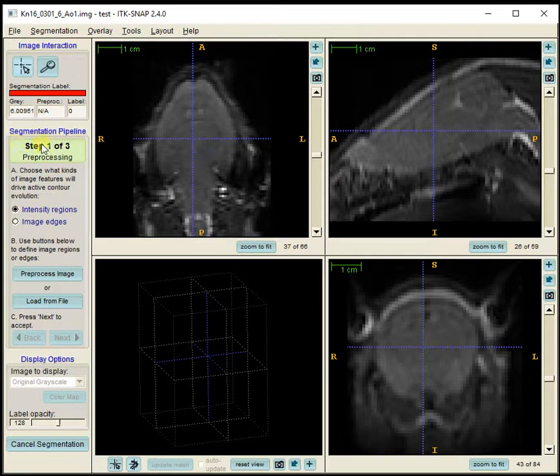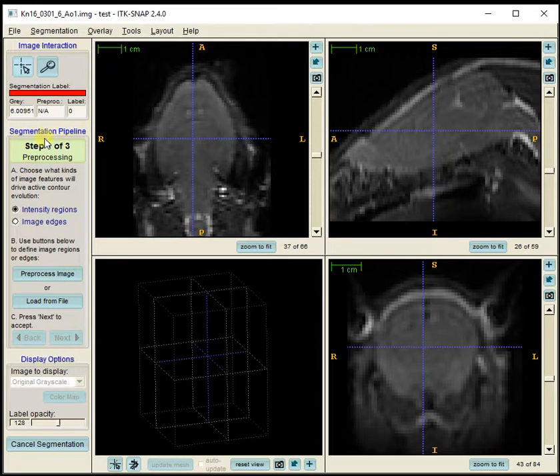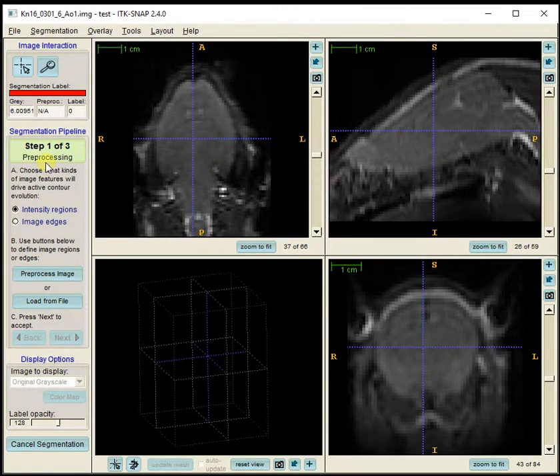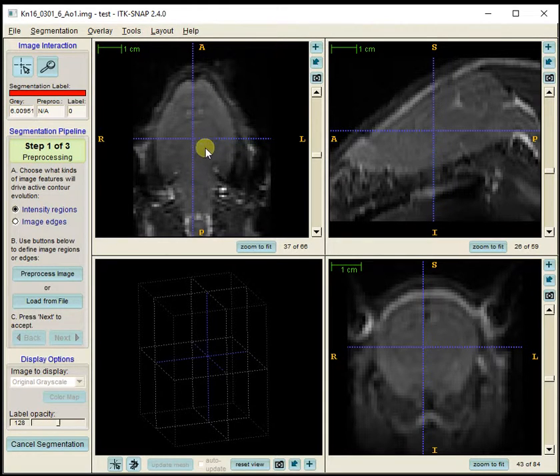ITK-SNAP gives you helpful steps — the text shows the segmentation pipeline, which is the workflow of the segmentation. Now we're in Step 1: pre-processing. I'm going to pre-process the image before beginning the actual segmentation.